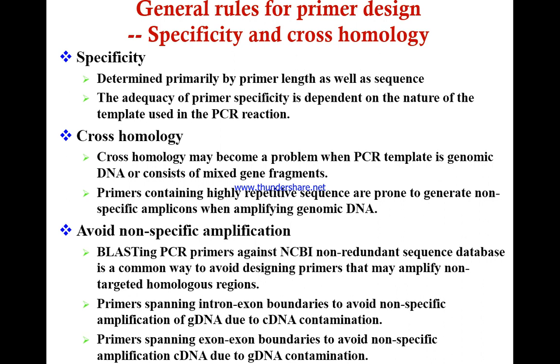Obvious, because it can bind to anywhere. Avoid non-specific amplification. Blasting PCR primers against the NCBI non-redundant sequence database is a common way to avoid designing primers that may amplify non-targeted homologous regions.